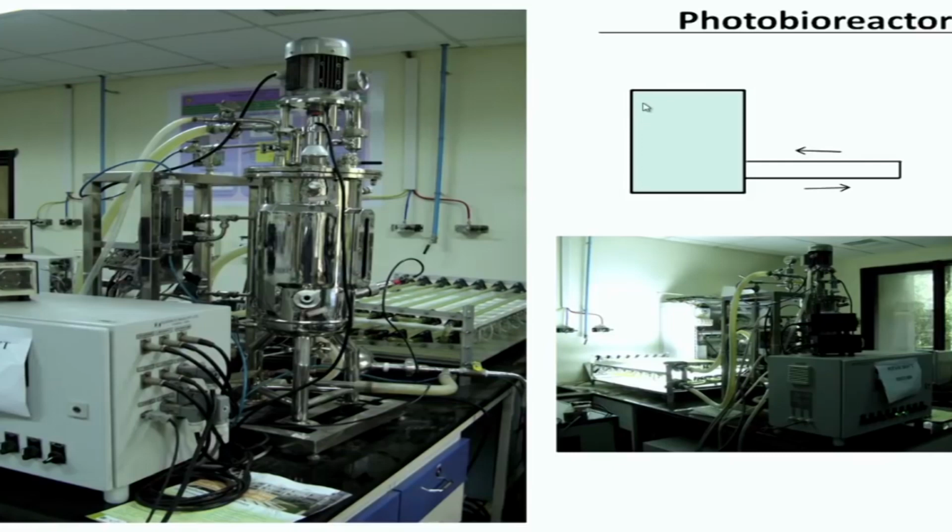Okay, this is the schematic of the vessel here and the photo section here. This you might be able to understand things a little better here. This contains the microalgae. They are let out here. There is a pump that takes it through the glass tubes in the photo section. They are exposed to light as is shown here, and they come back and they photosynthesize to accumulate bio oil.